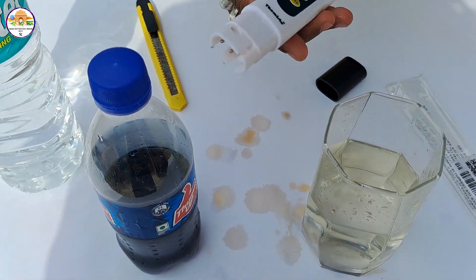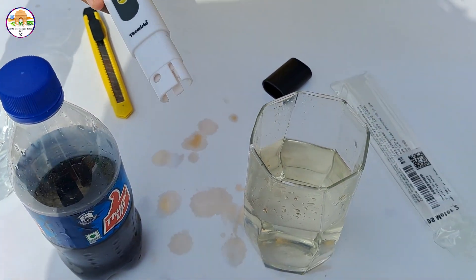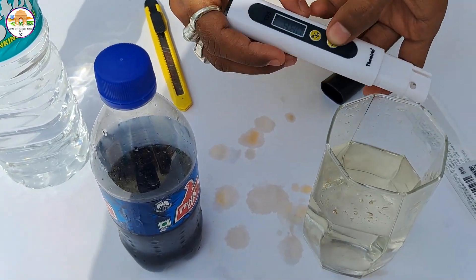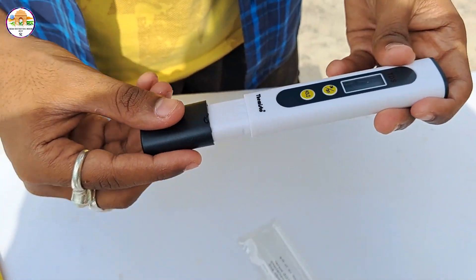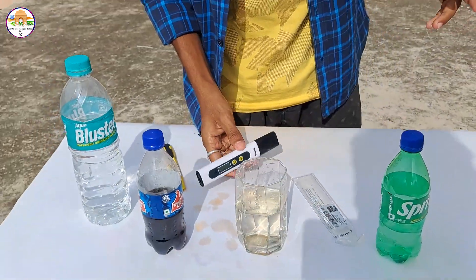This is the first one going to test the TDS operation. So, today we are going to show you this experiment in this video.